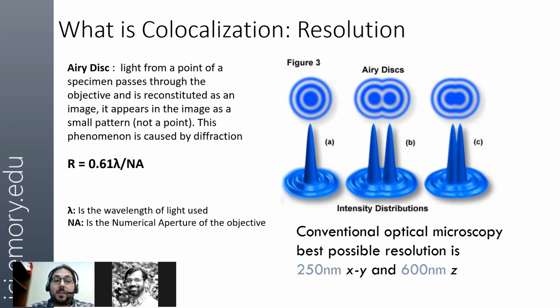The amount of resolution we're able to get on an object or a structure relates to the wavelength of the light used and the nature of the objective we're using, the aperture in general. So smaller wavelengths of light are generally able to resolve more detail, but they're also more harmful to a lot of samples.